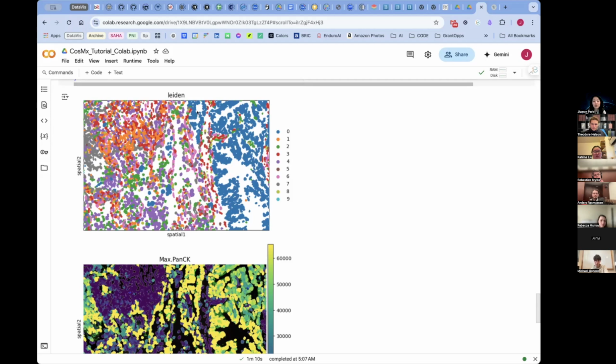For example, lung over here is highly spatially compartmentalized. You can see alveolar regions, you can see airways. Liver is very zonated, where you can see different metabolic functions across the space. And it depends on the context, but you can start to question how the immune infiltrations and inflammation regions invade different locations within the body, limited only by your knowledge of the biology.